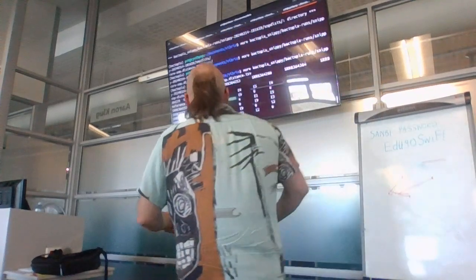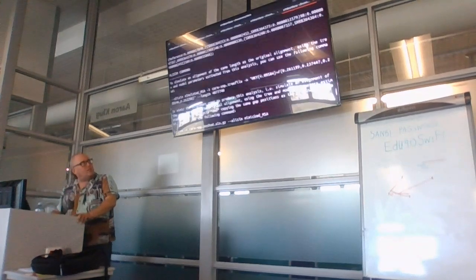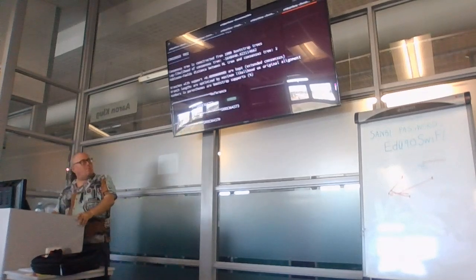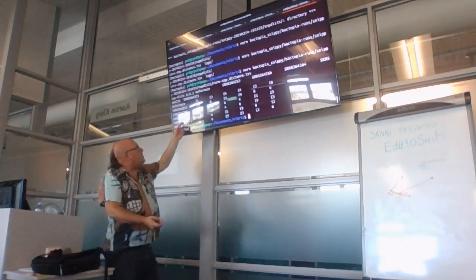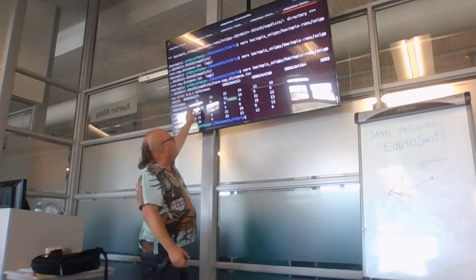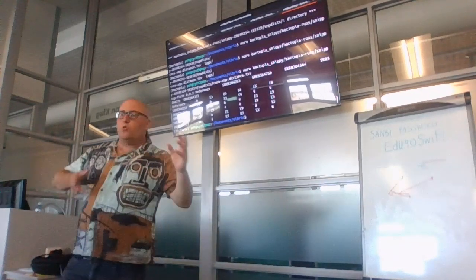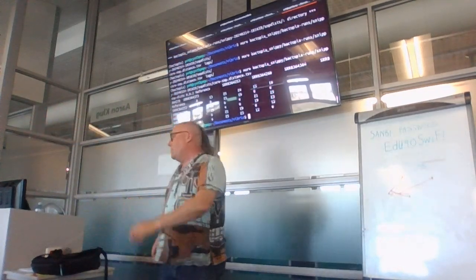So going back to our tree, we wanted to know some of these differences. Let's have a look at 370 over here, 370 versus 253. So here's 370, and it's not easy to read this thing, but I think the second column is 253, and we see there's 8. So what tool do we have that works nicely with tabular data? R. Okay?